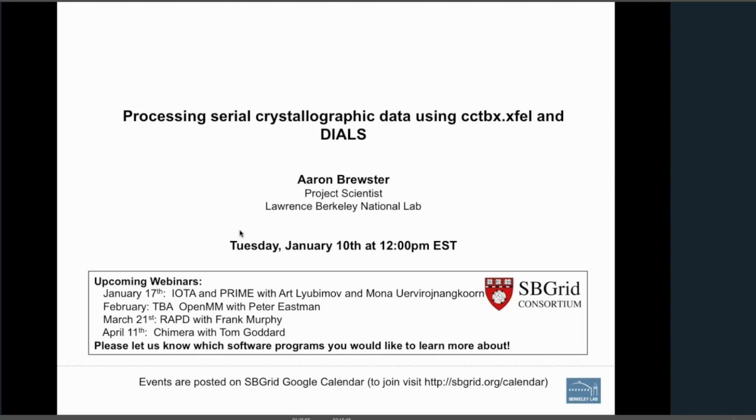So in the plot that you just showed, you could conceivably filter out more than 2 or 3 or 4 by tagging sets by number of lattices or something like that. Well, the tags are more for groups of data, but we could do something similar to that. Absolutely. This software is so custom. Please be in touch if you want to do something like that.